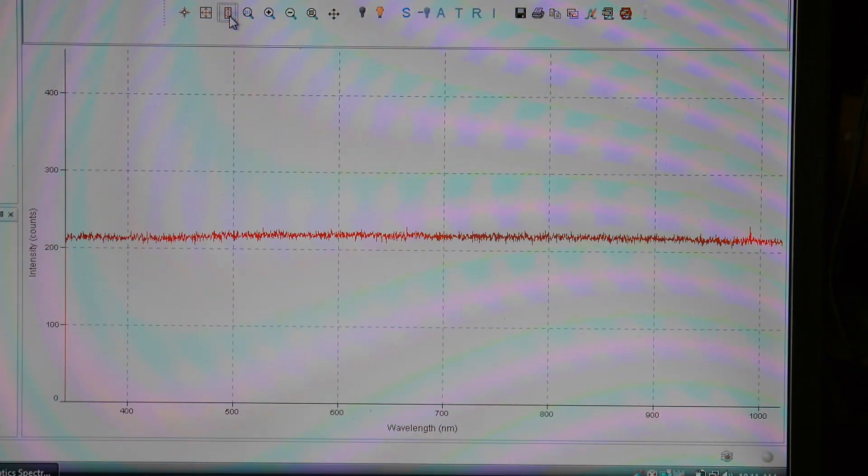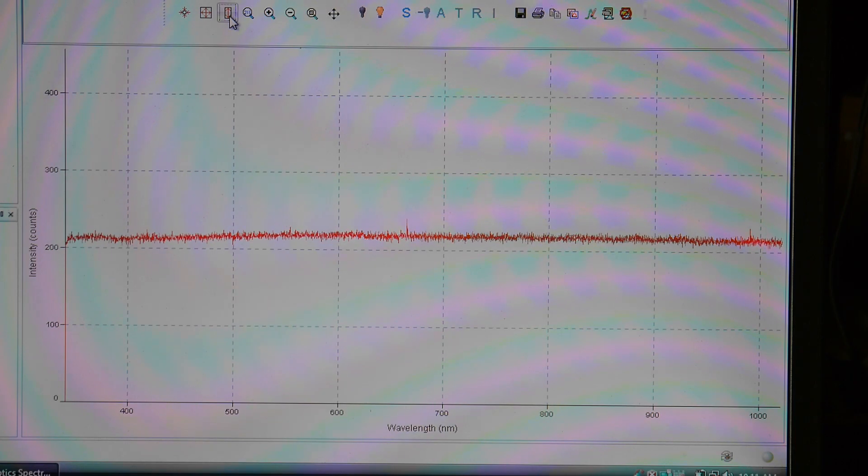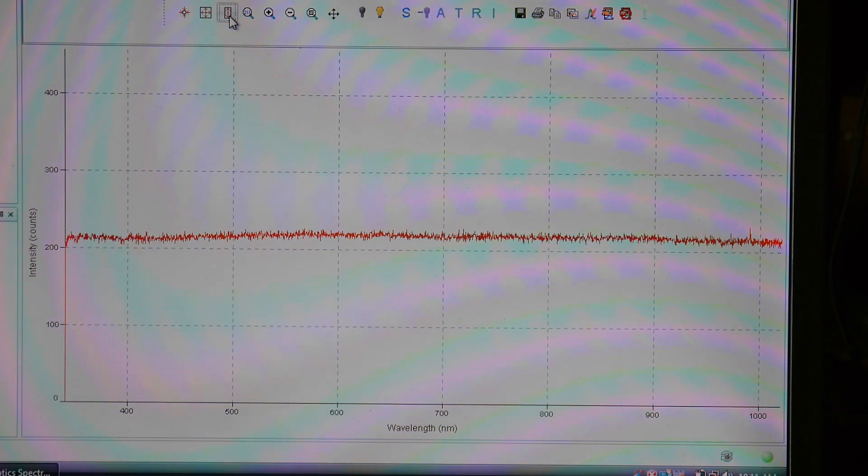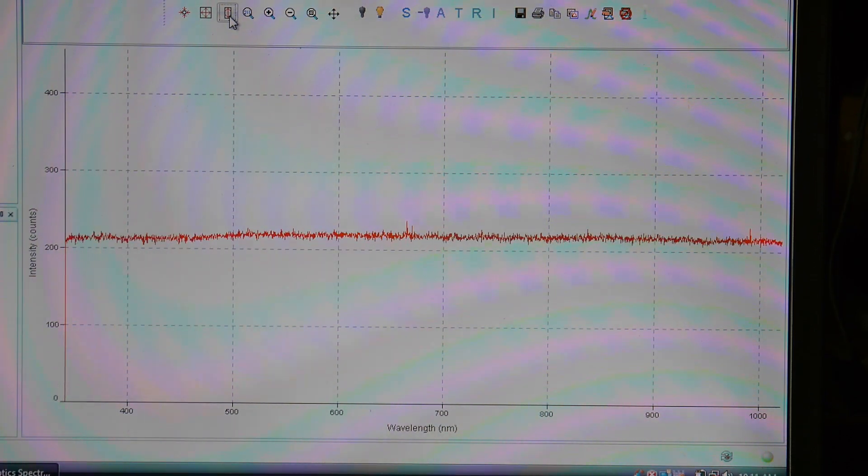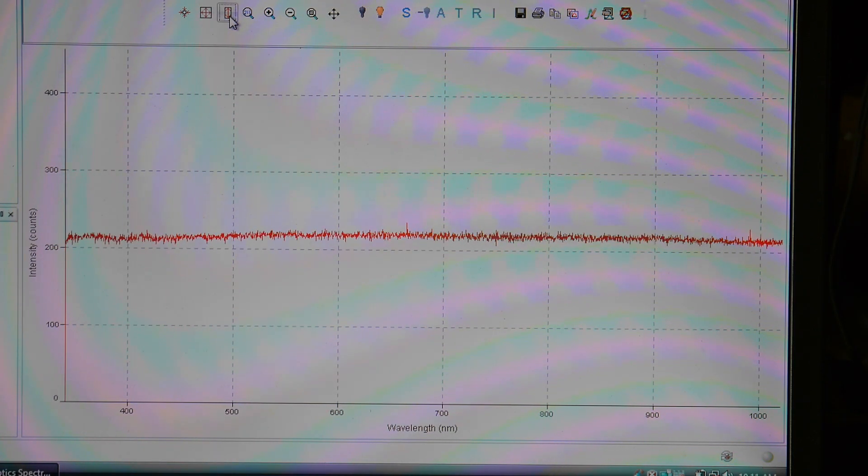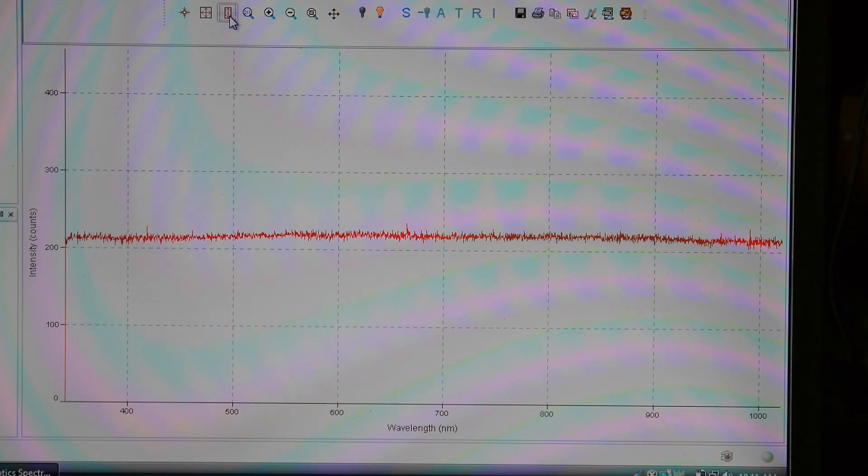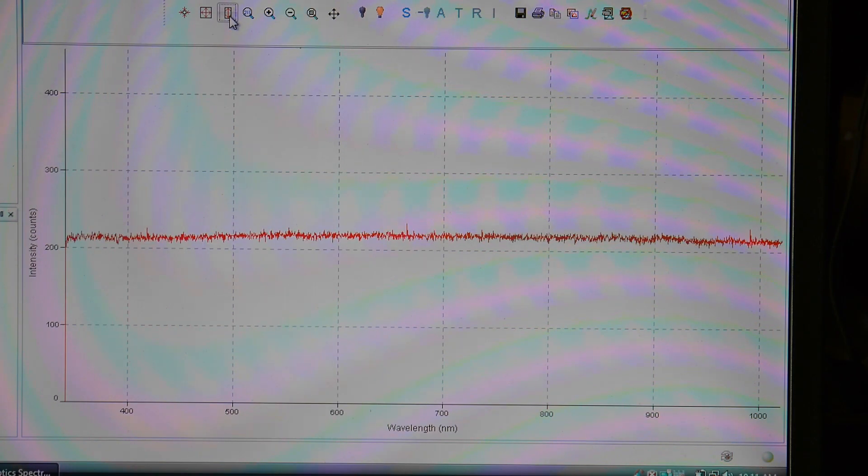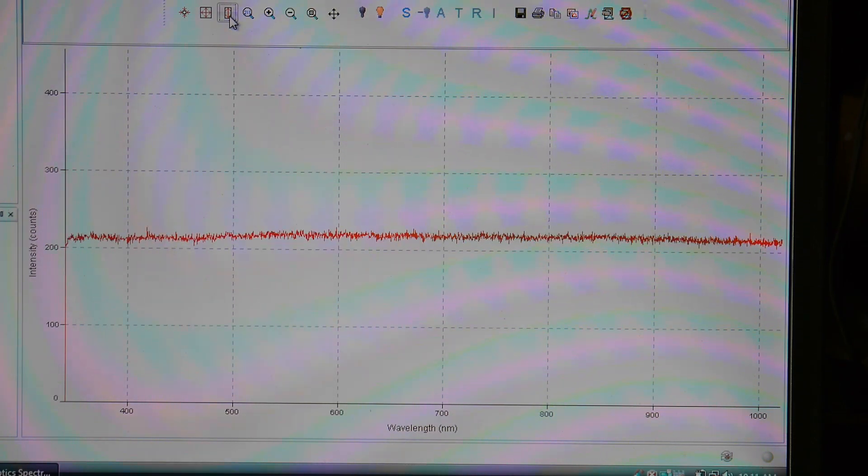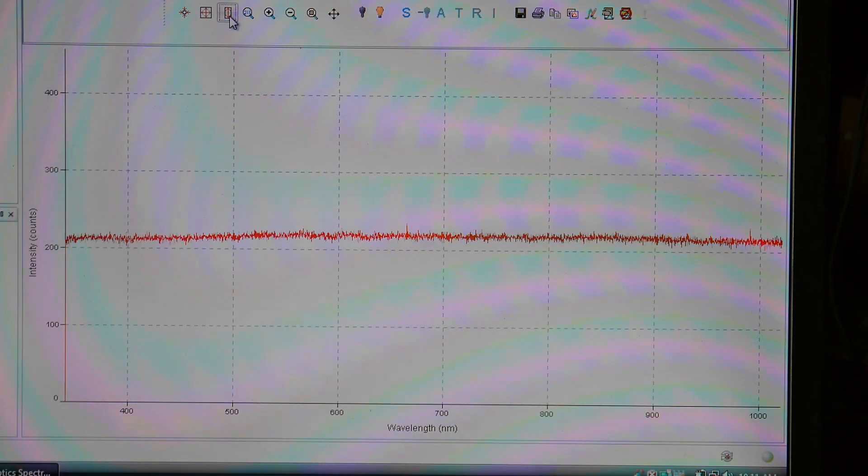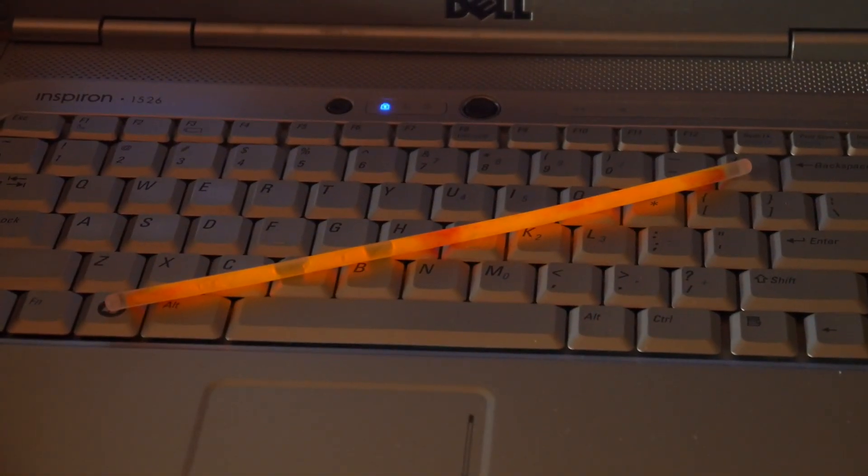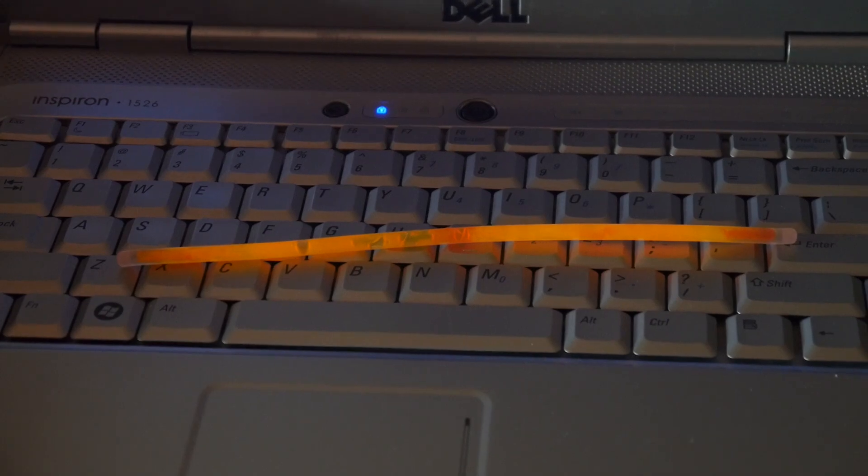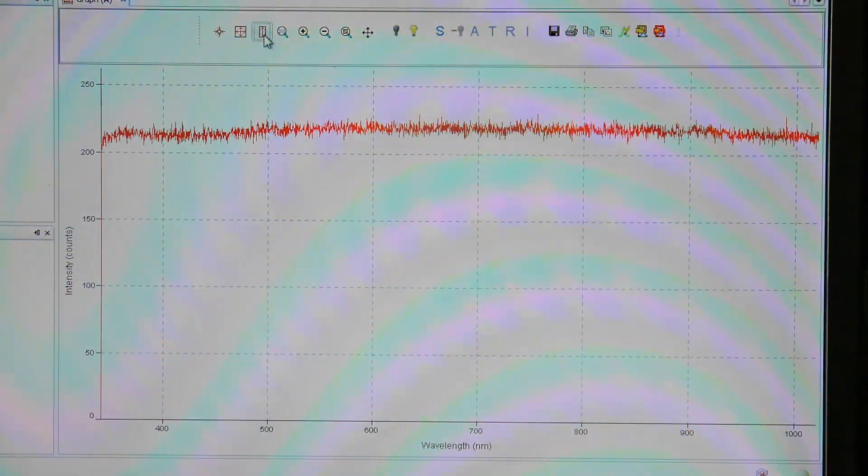Let's see here. What is this one? This is an orange one. So crack that open. Shake it up. So the way these work is there's a glass vial inside these. You break the glass vial open. There's a chemical in the glass vial and there's a chemical outside the glass vial. They mix together and they start to glow. So I'll put this one down. It's kind of an orangey color. There's some red in there too that hasn't been mixed up yet. So I'll shake that around a bit more.